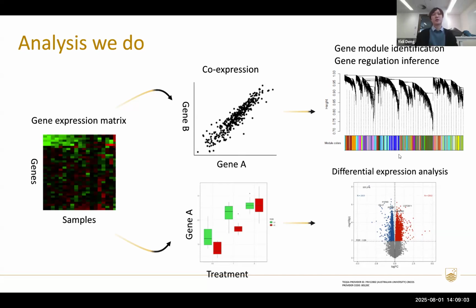Or we can do differential expression analysis. Basically, we compare samples of different conditions, and we correlate the changes of the expression profile to their functional changes or observed phenotypic changes.